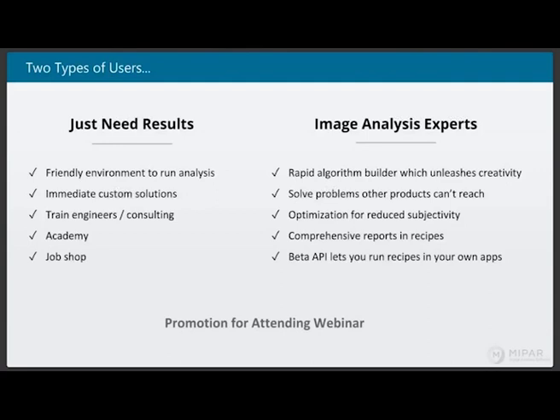MIPAR offers an environment where anybody with a keyboard and mouse can drag in recipes that are either from our freely available recipe store on our website or built custom quickly by our experts. Just drag them into the software, get your measurements, batch them if you want to, and move on to your next project. We offer training and consulting to your engineers, even on just how to run a recipe, not necessarily how to build one, but if you have some people in-house that want to build recipes from simple to hard problems, we offer accelerated training for that.